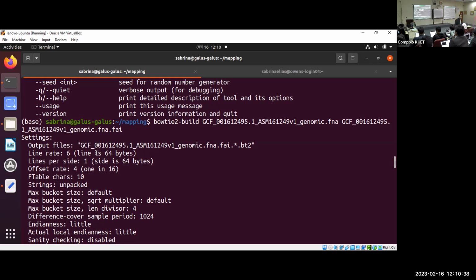So what we are doing now is in our own computer, right? We are not working in the HPC. Are we all okay? I mean, we transferred the files to HPC, but the Bowtie option we are writing now is not in the HPC. It's in your own computer. If you are doing it on HPC, then just stop it there and we will do it in our computer. At first, we are doing it in our computer.